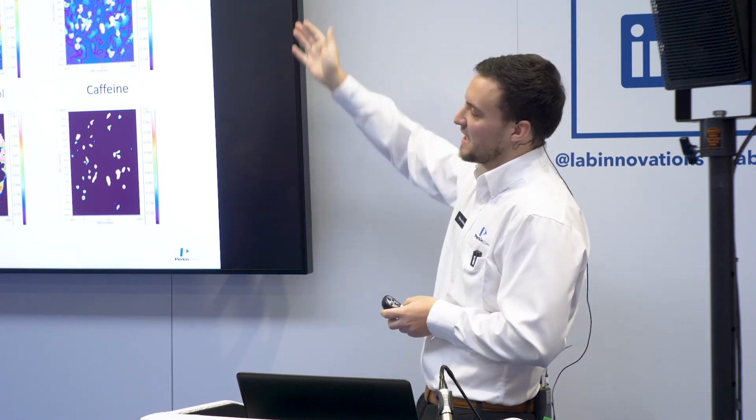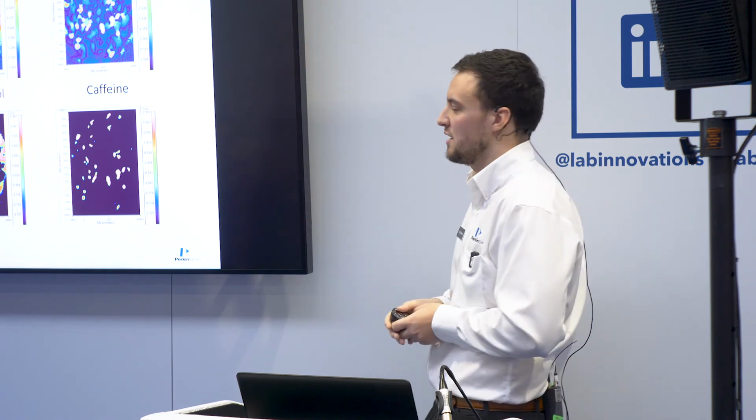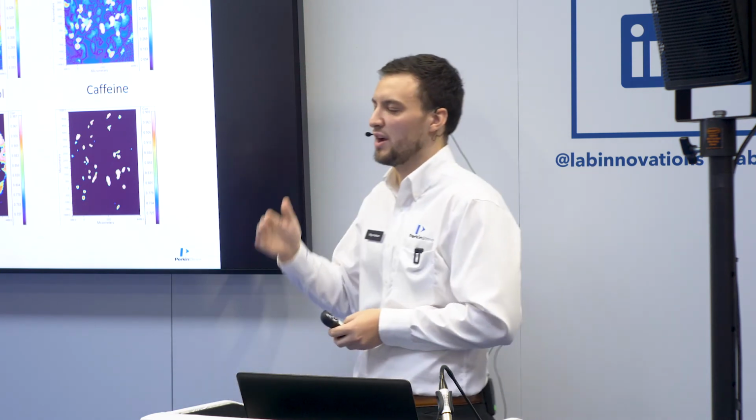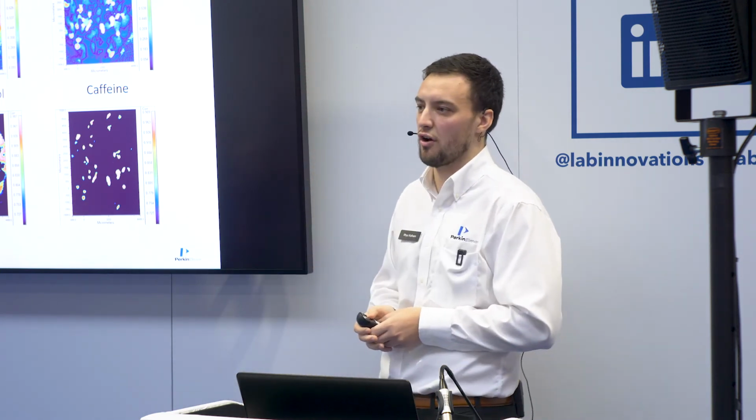So what we do is we set a threshold of the correlation number, and then we generate something that looks like this. Now you can see a lot easier where your APIs are distributed within your tablet by creating a threshold of the correlation value.